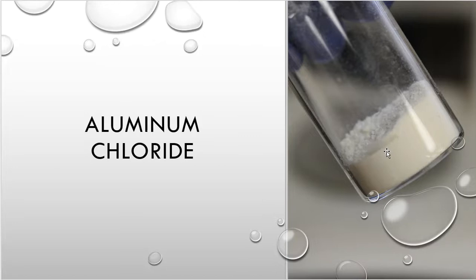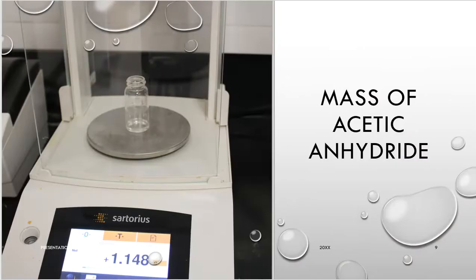But that is what aluminum chloride actually looks like. So we've talked about it in lecture, and now we're using it in real life. Okay. Mass of the acetic anhydride is going to be next.